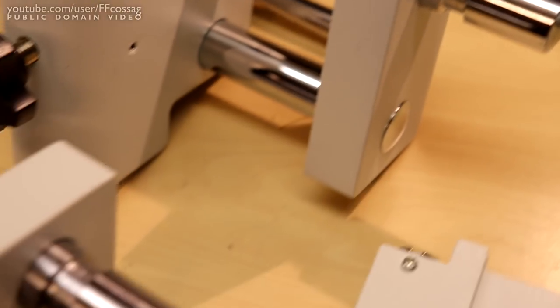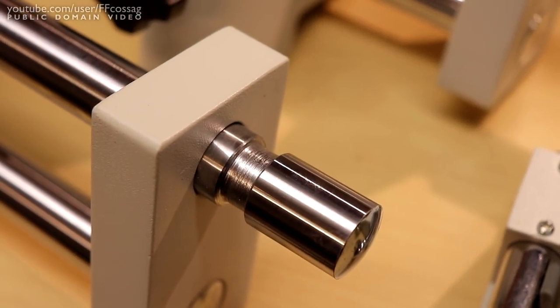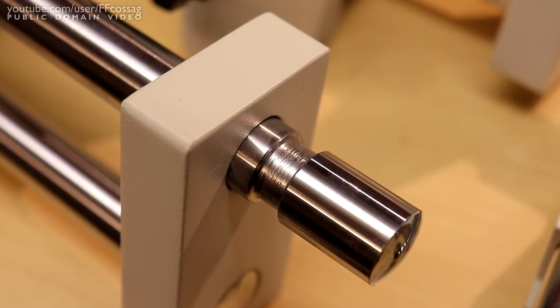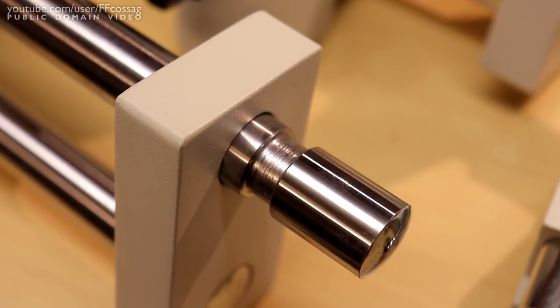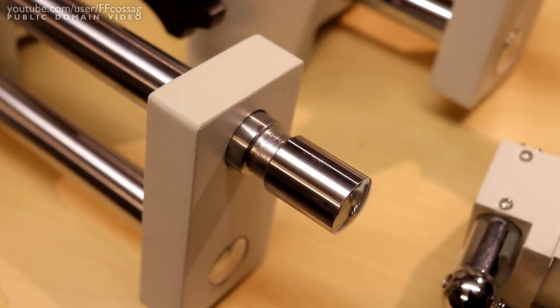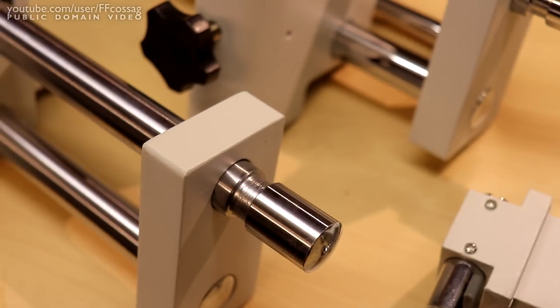I gave this one the exact same treatment and you can see that's a very minor mark, but I really went at it. There's absolutely no comparing the two. This new rod is a lot harder than the old one.